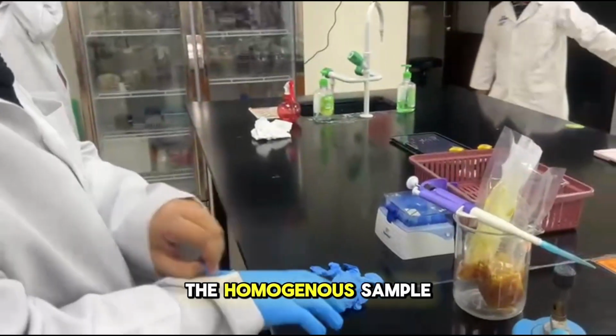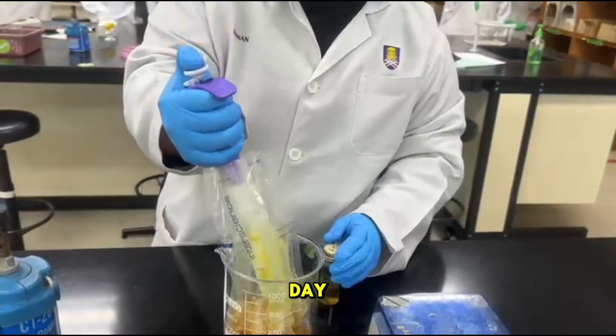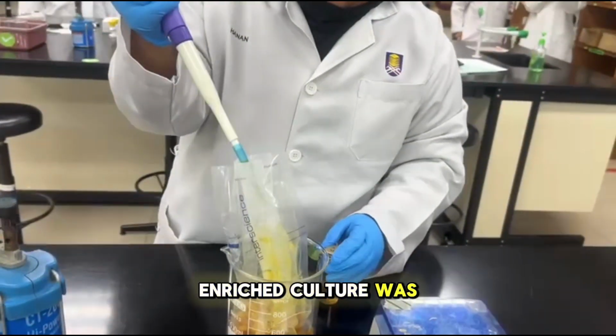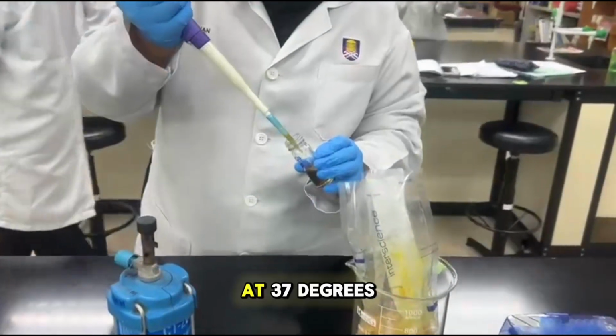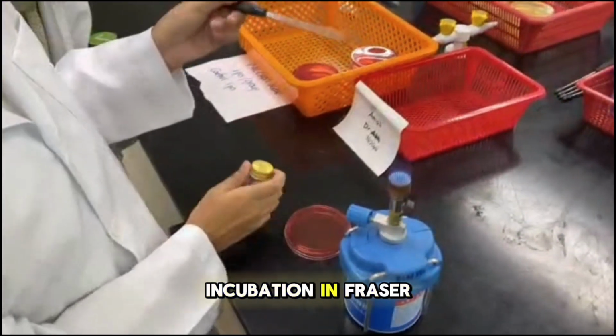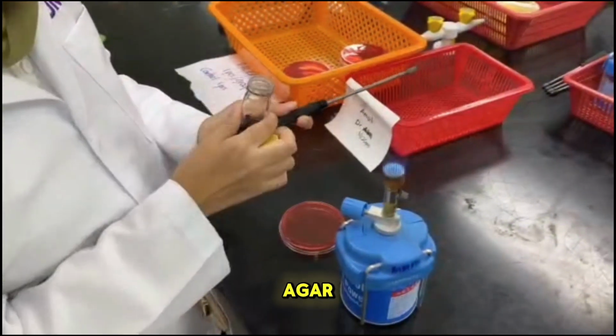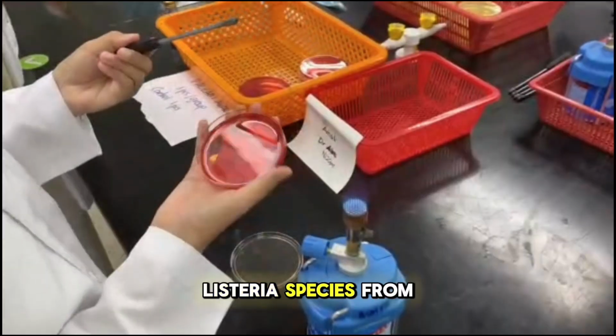On the first day, the homogenized sample was added into UVM enrichment broth and was incubated for 24 hours. On the second day, after incubation, 1 ml of enriched culture was transferred into Fraser broth. The Fraser broth was now incubated again at 37 degrees Celsius for another 24 hours. Day 3, after incubation in Fraser broth, the culture was streaked onto Palcam agar using the streak plate technique. Palcam agar is a selective and differential medium commonly used for isolating Listeria species from food samples.